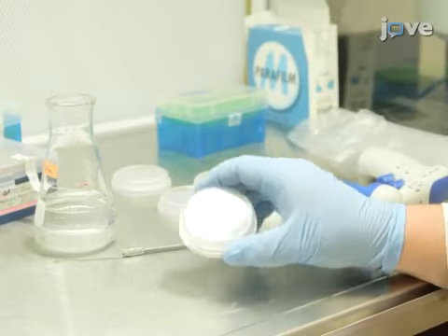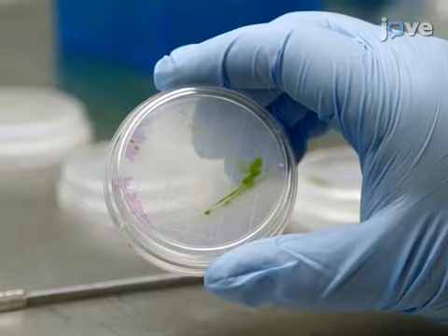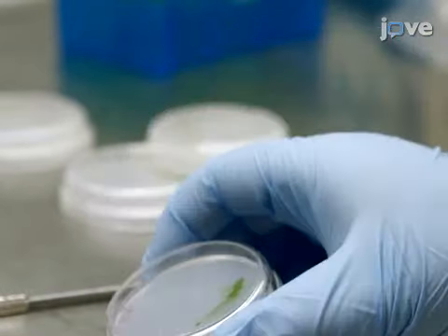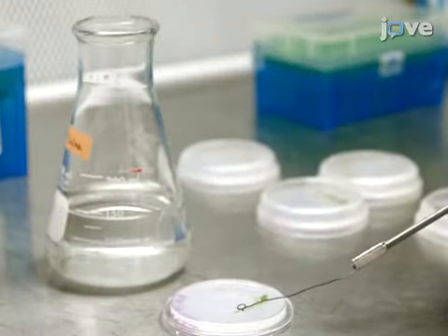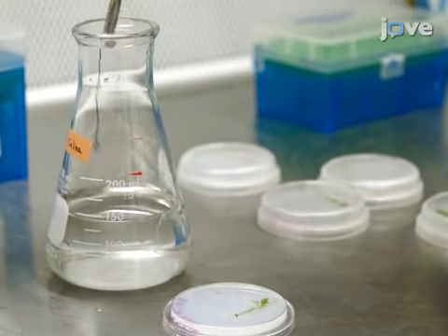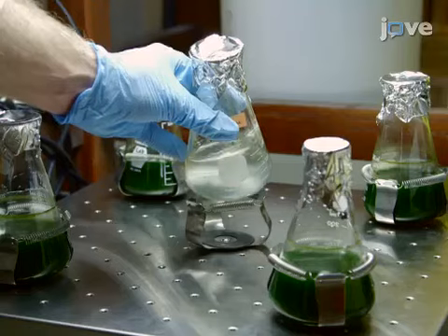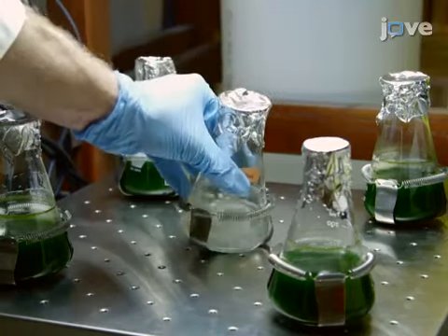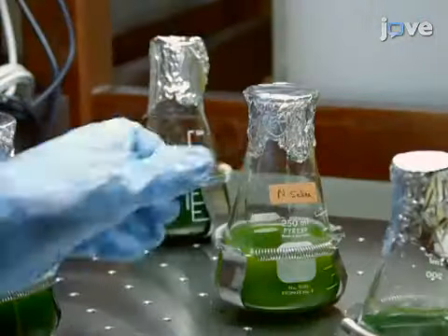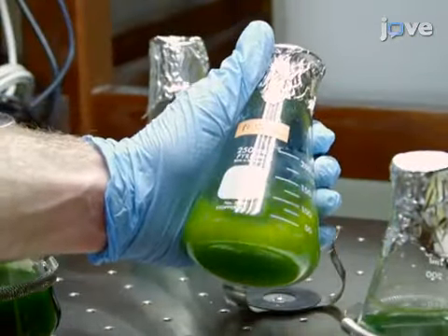To prepare N. salina inoculum, after growing colonies in sterile petri dishes according to the text protocol, inoculate 200 milliliters of previously prepared nutrient-rich medium in baffled Erlenmeyer flasks with N. salina colonies and incubate them on an illuminated shaker table. Allow the culture to grow until the medium becomes green.